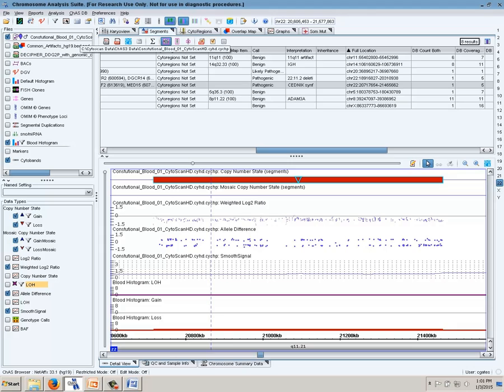If you prefer to go back to review how the PDF reports are done, please go ahead and, as I showed earlier on our website, on the tutorials page, the training page of tutorials under ChAS, you can see the PDF reporting options, as those haven't changed since ChAS 1.2.